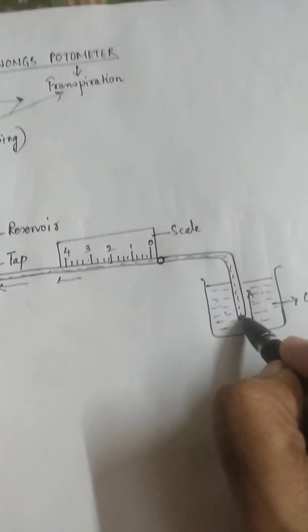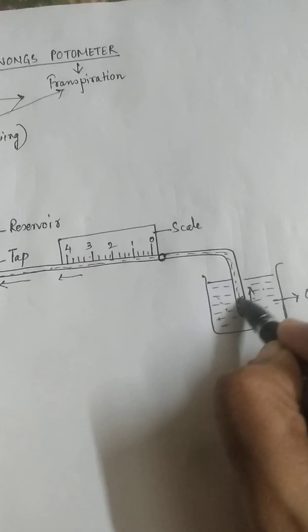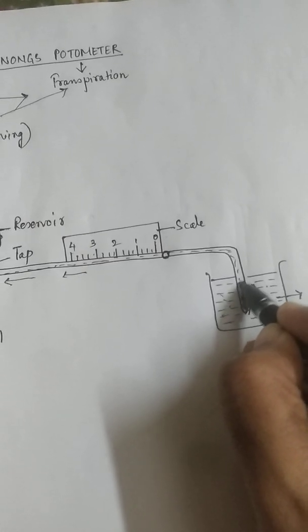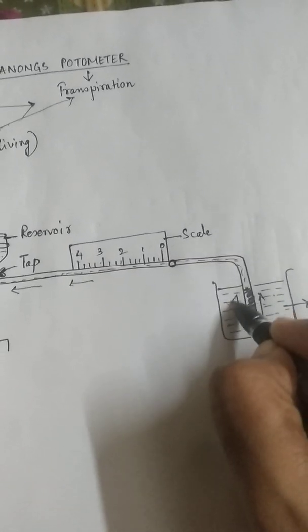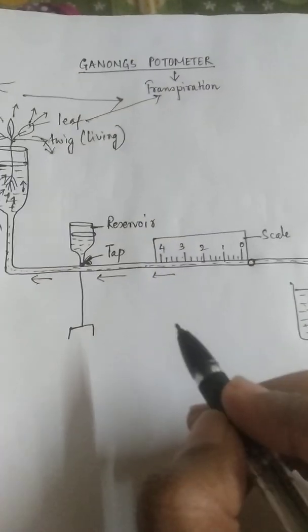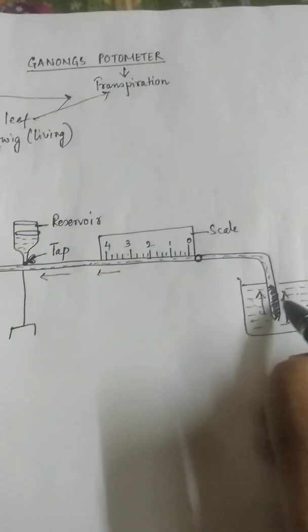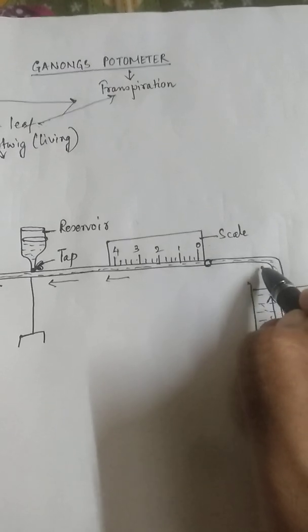So you will see that this colored water is gradually rising as time is passing by. This colored water is actually gradually rising through this tube.